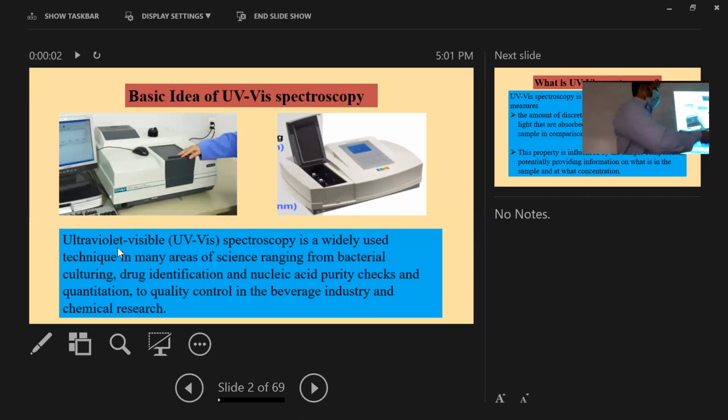Because when we look at the energy of the lights, even if I don't want to put this light towards my eyes, if accidentally this light goes inside my eye, that will not damage my eye severely. Sometimes if you put your light on for a long time, you can feel that you cannot see very clearly.